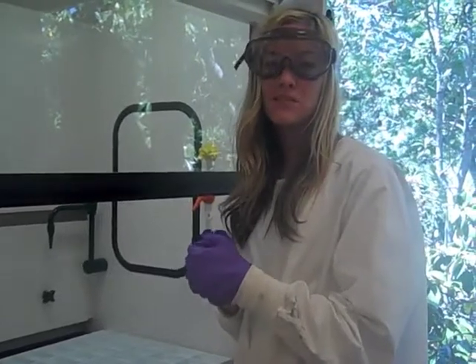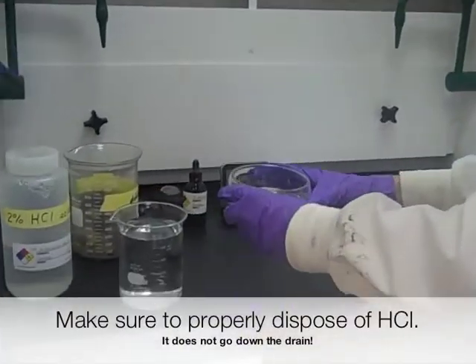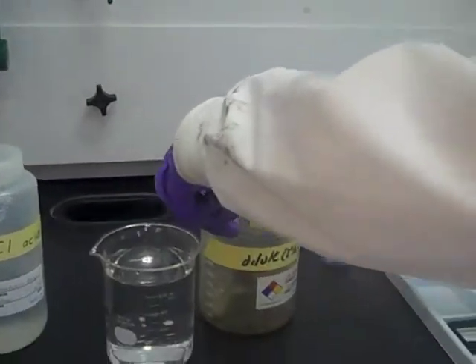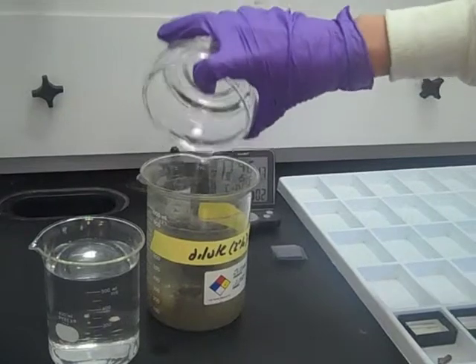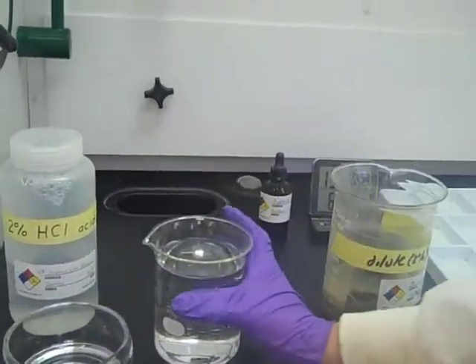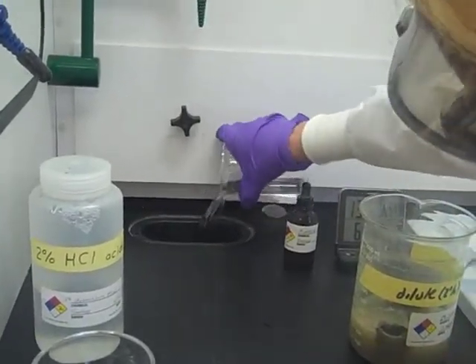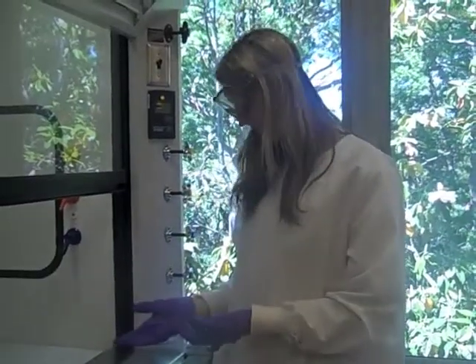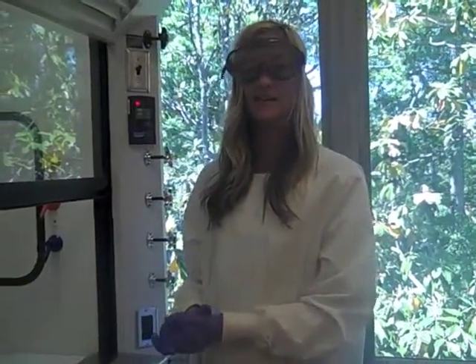Now you want to make sure you properly dispose of the materials you used. We're going to start with our hydrochloric acid — we're going to pour it into this tub of limestone so that it neutralizes the solution, and then pour that down. Our next step is to wait for our bryozoans to dry so that we can make the acetate peel.